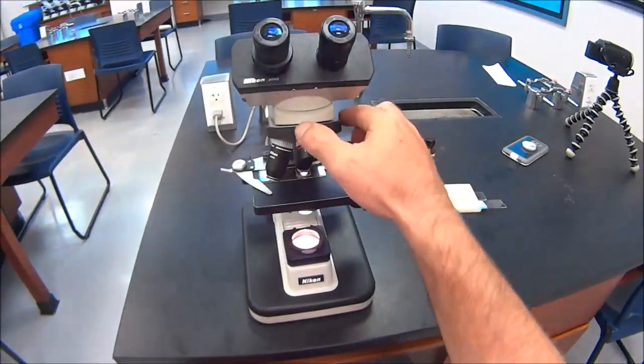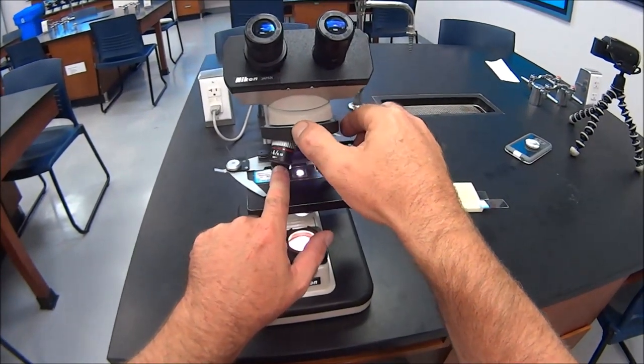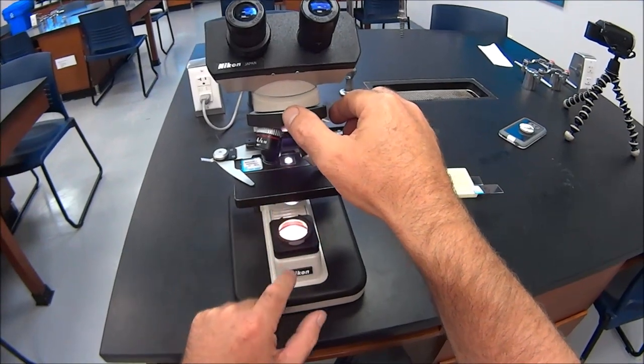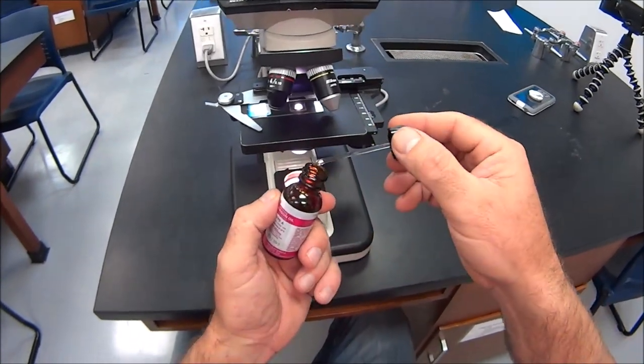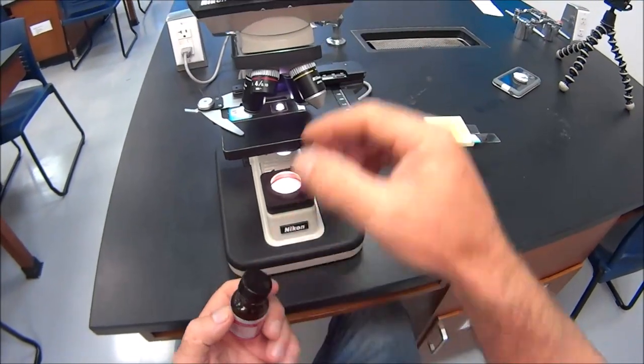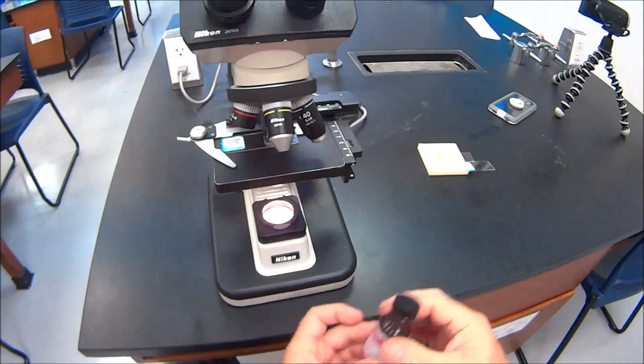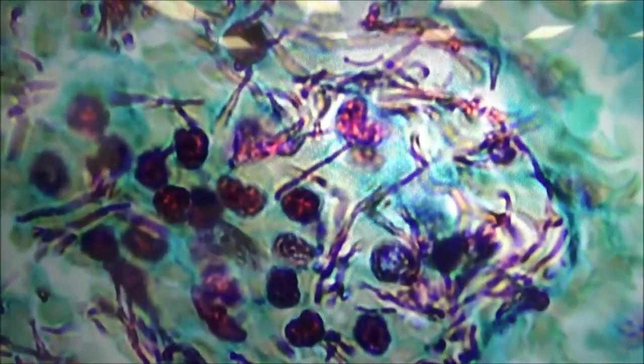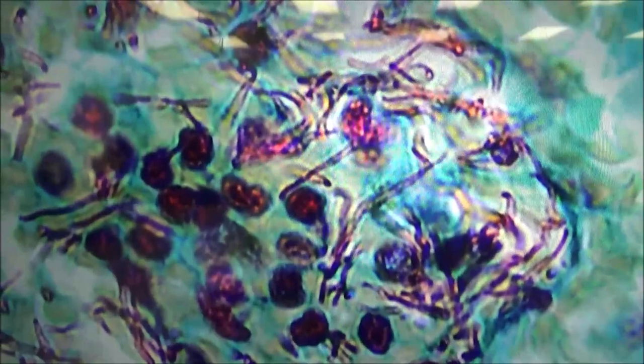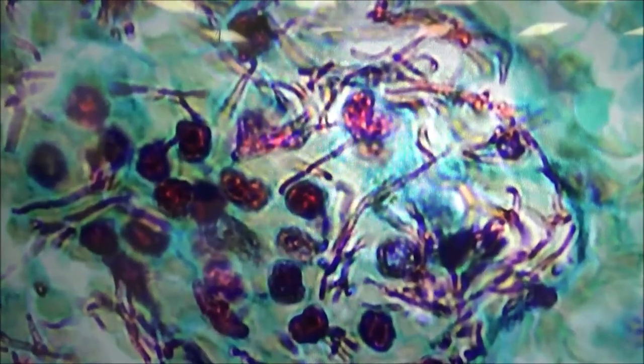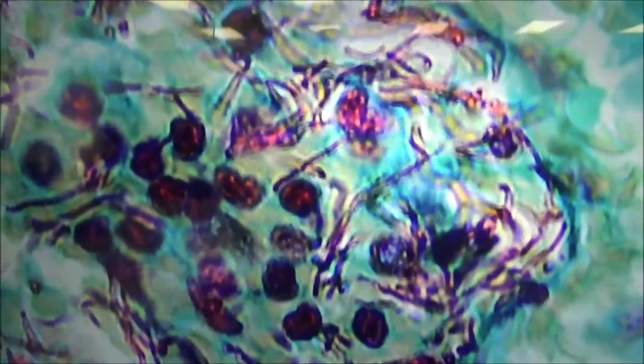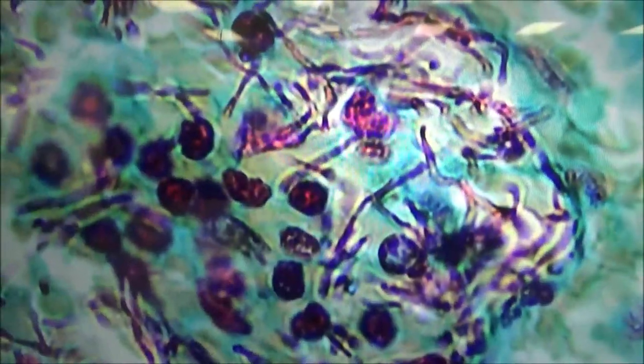Let me go to the highest power. Finally, we want to use the big lens, what's called oil immersion. That's 100x, 100 times what the naked eye can see. We have to use immersion oil, and I'll explain why in just a moment. Take a little drop of this and put it on the slide, right on the slide. Rotate the lens into the oil and focus. I'm getting it in focus at the highest power, and there they are. So the rod-shaped or string-like red structures, those are the bacteria, bacilli-shaped bacteria. The round red dots are the nuclei of the lung cells, which are stained bluish. So you've got the dark red round nuclei and the blue cells of the lungs, and then those red strings are the bacillus.